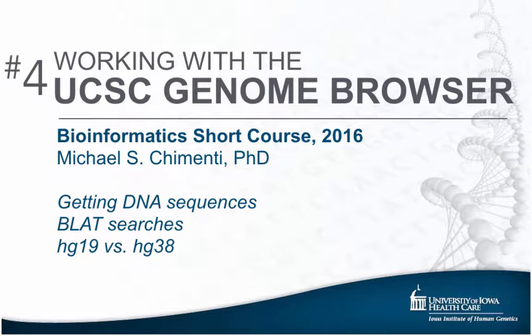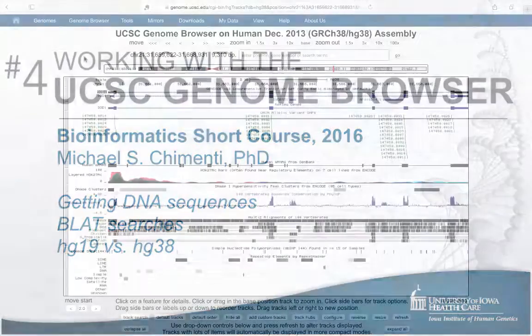Welcome back to Part 4 of this series. I'm going to discuss how to get DNA sequences from a particular region in the browser window or from a gene of interest, and how to search that sequence against the genome using the BLAT tool. I'll also briefly compare the HG38 assembly, which we've been using, with HG19, which is still the current default assembly even though it's older.